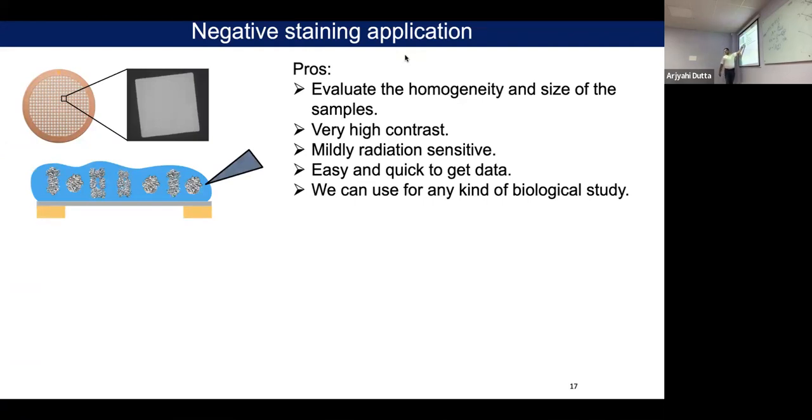Then we blot the excess buffer, because inside the electron microscope, everything should be under vacuum. That thing I forgot to tell. Three things are different from light microscopy. One is the light source, it will be electron, and then electromagnetic lens, not the glass lens. And the electron microscope is always in a very high vacuum. Why is high vacuum required? Otherwise there will be collisions with air or any moisture, and then electrons will deviate from their position. That is the reason we need it.